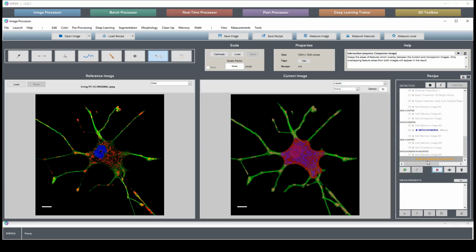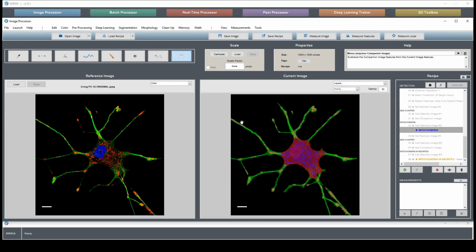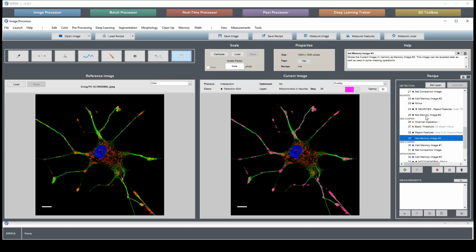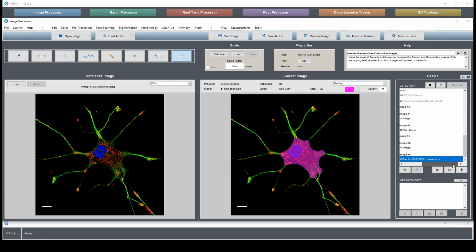So now let's grab the mitochondria that are in the cell body. It's tempting to simply subtract the mitochondria in neurites from the entire mitochondria, but then you end up finding tiny little pieces like this, pieces of mitochondria that are outside the neurite but not within the cell body. So it's better really to take our cell body here and do the same thing that we did with the neurites, is do an intersection.